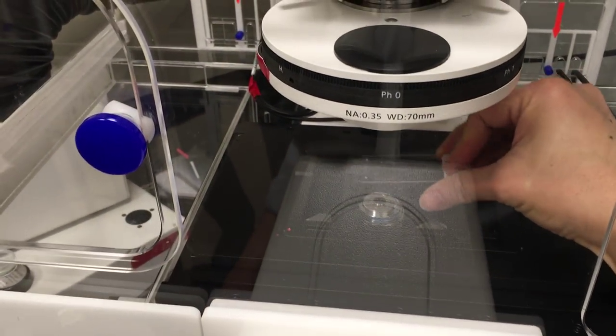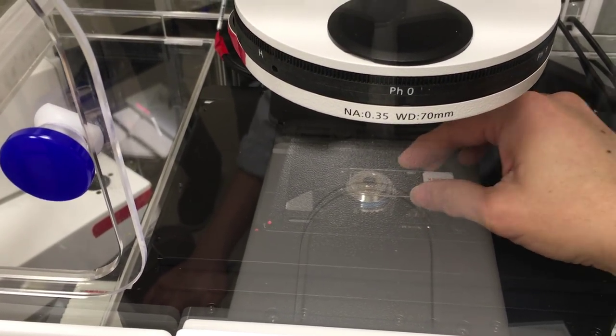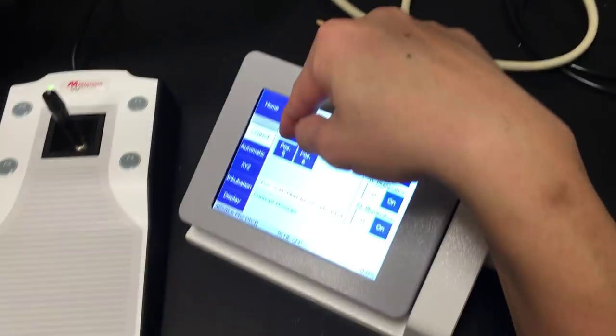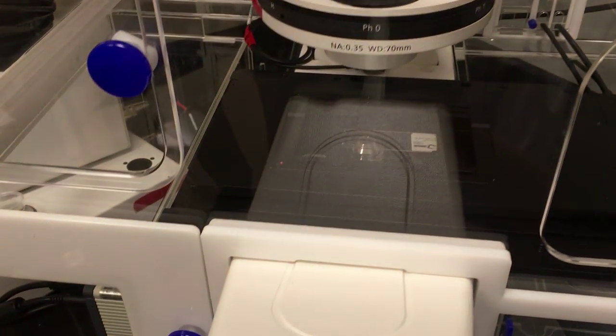It looks like you've got all long-working-distance objectives, so I can actually use the 1mm because they're actually designed to work with—to look through 1mm thick material, even glass or plastic. So you don't have to turn it upside down. If you do turn it upside down, then you have to adjust the correction collar to get the best focus.